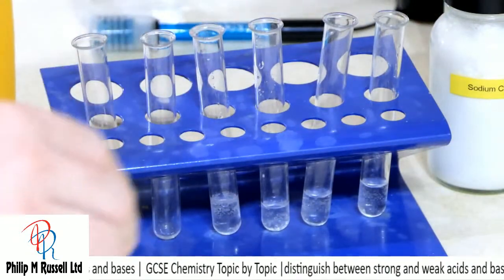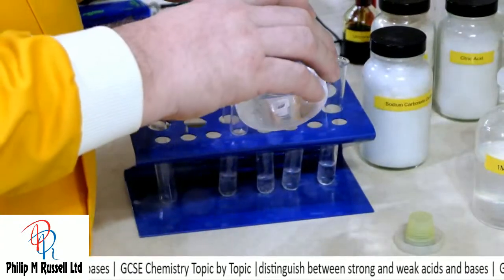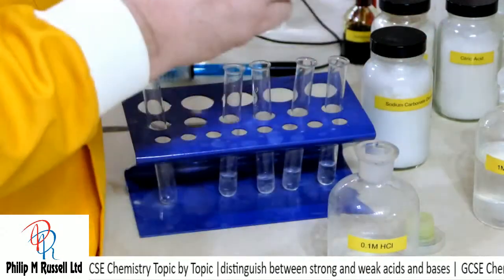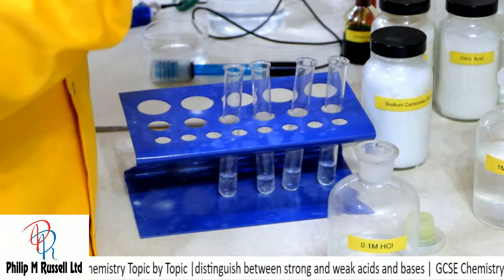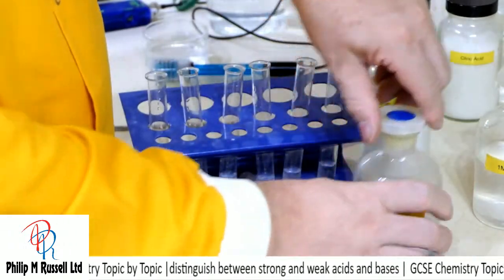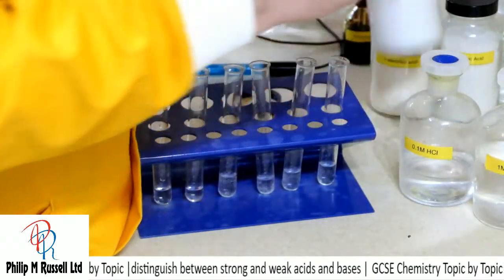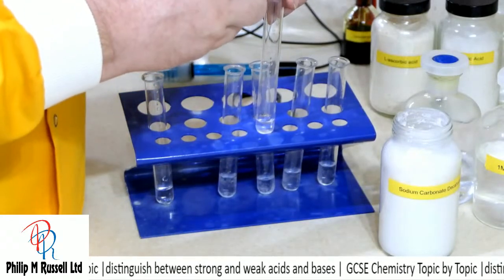Let's see if the 0.1 molar makes any difference. Put about twice as much in there as I wanted, and what I'm going to do is I'll put that in another test tube. Right, let's try it again. So we take our sodium carbonate, and this is now 0.1.